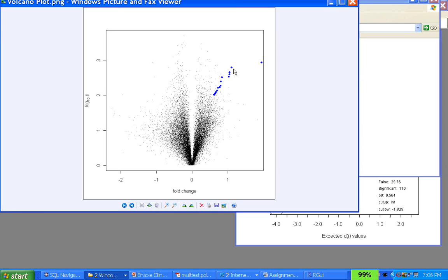If you can produce such an output and have this discussion in your presentation to say, this is how the overall landscape looked, this is how the fold changes and p-values were, these regions seem significant, these are the genes that I'm outputting, this is the pathway that's mapping, that would be a good tool set for you to have in the future should you do this kind of work.